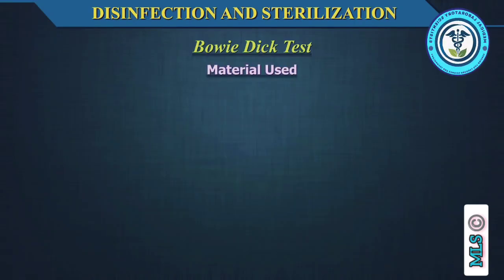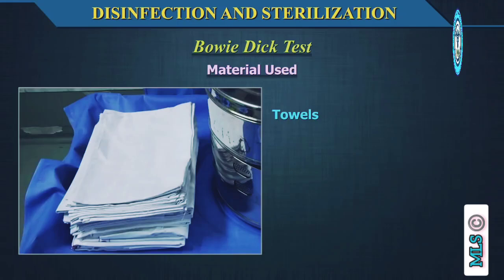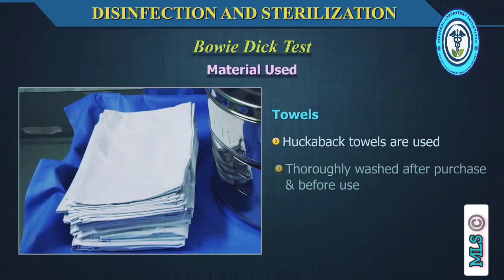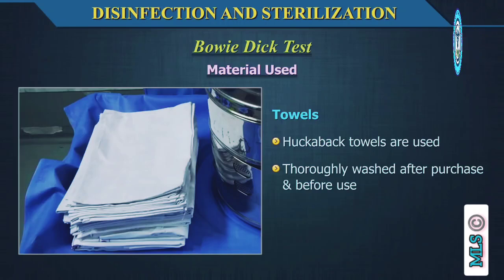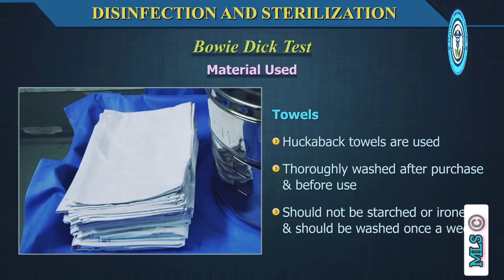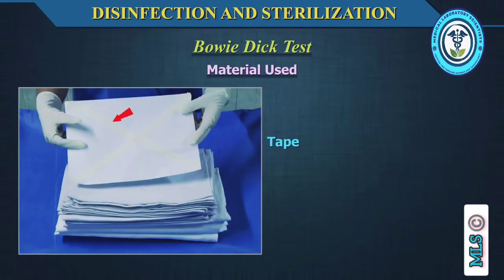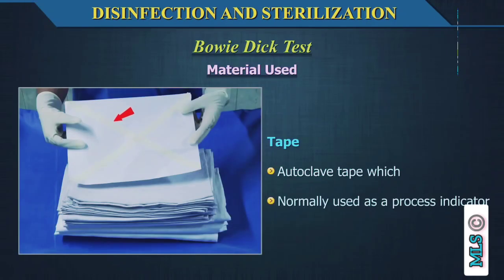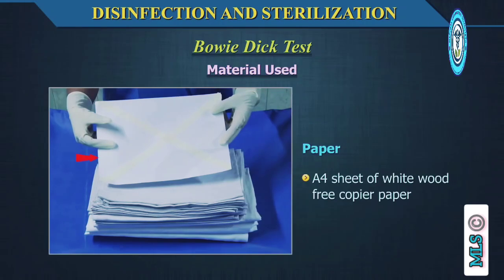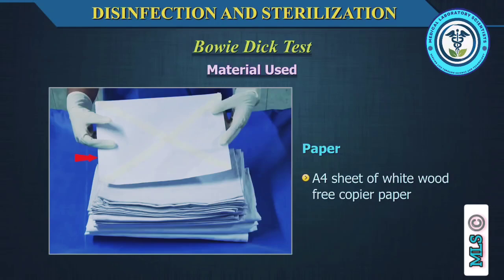Materials used. Towels. Ideally, huckaback towels are used. They are thoroughly washed after purchase and before use. The towels should not be starched or ironed and should be washed once a week. The tape recommended is autoclave tape, which is normally used as a process indicator. The paper should be an A4 sheet of white wood-free copier paper.